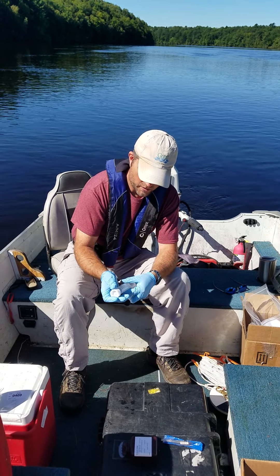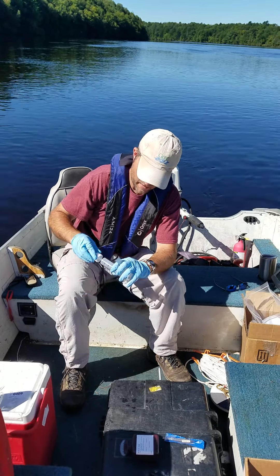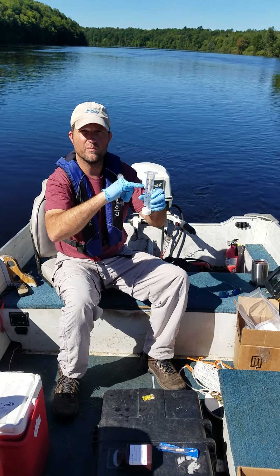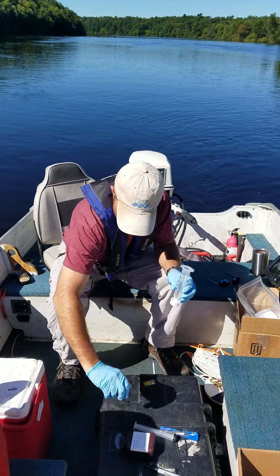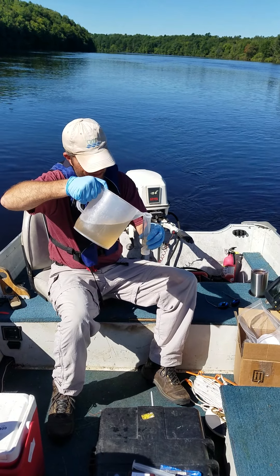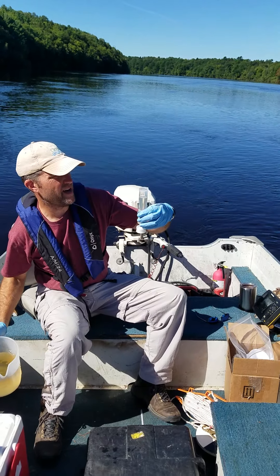I've taken my sample here and already got it ready. All I need to do is take this filter housing — it can only go on one way, the other fitting doesn't work — and just put that onto the end of the syringe, nice and snug. Then you're going to pour in your volume and measure it. Just note that your volume numbers are going to be upside down, so you have to read in the opposite direction.